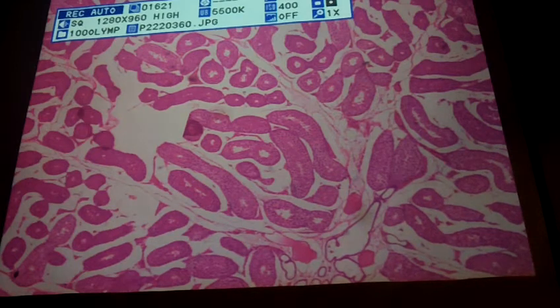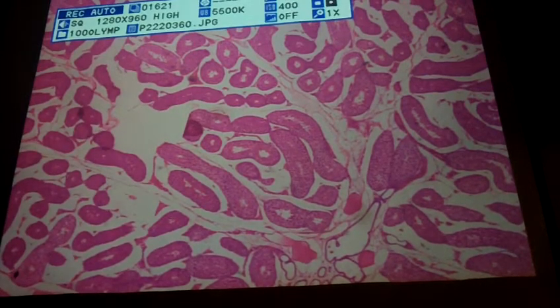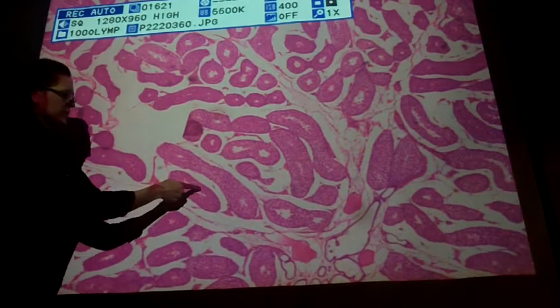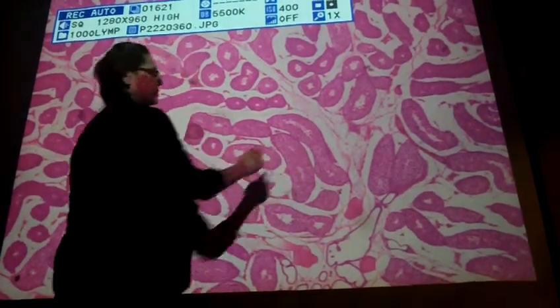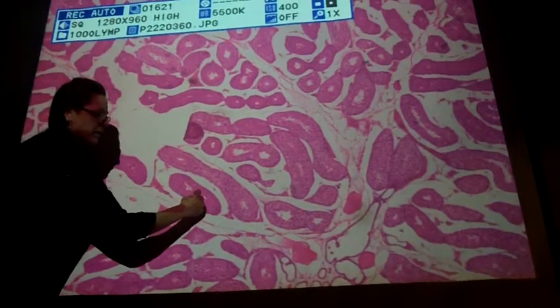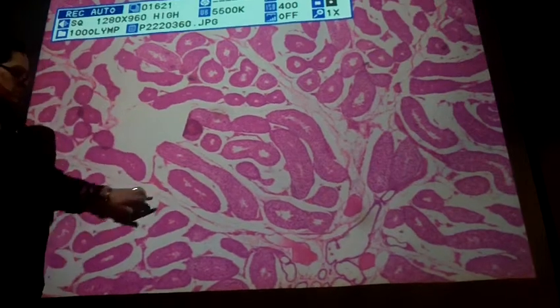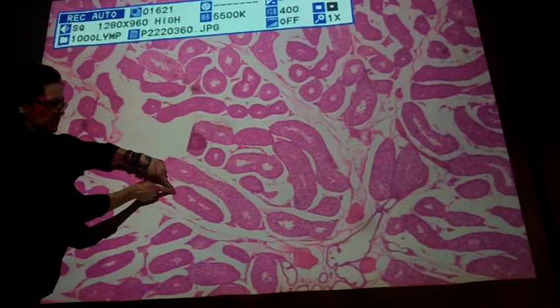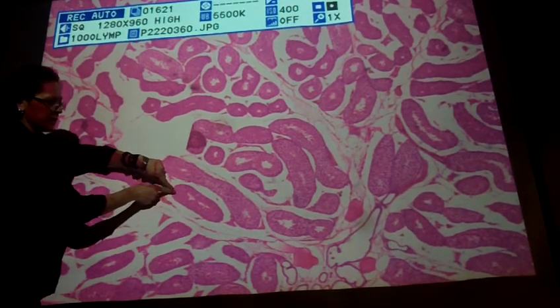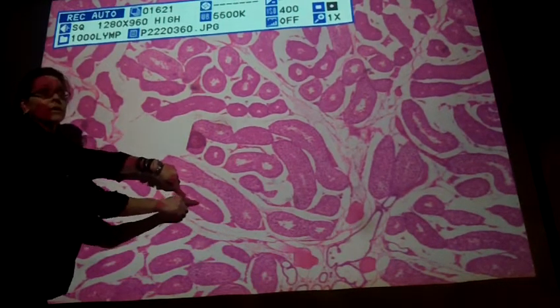here you can see that the wall of these tubules is much thicker. So again, remember in the testes, they're very slender but tightly coiled seminiferous tubules. And so that's what you're seeing here. Here's a tubule, here's a tubule, here's a tubule, and so on and so forth. And the wall here is very thick because those nurse cells are here in the wall of the seminiferous tubule. And all those rounds of cell division, this would be the basal surface, and those cells, the primary spermatocytes, secondary spermatocytes, spermatids would keep moving closer and closer to the lumen down here.